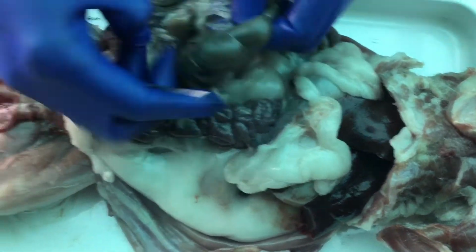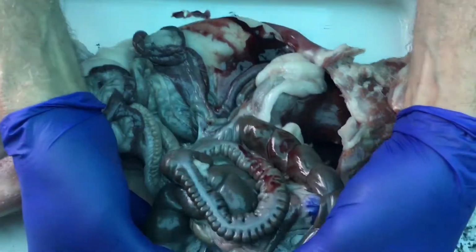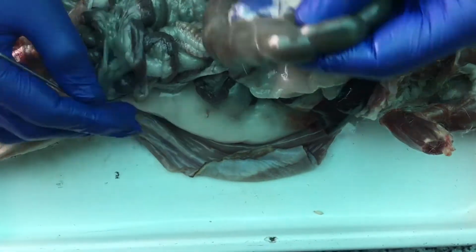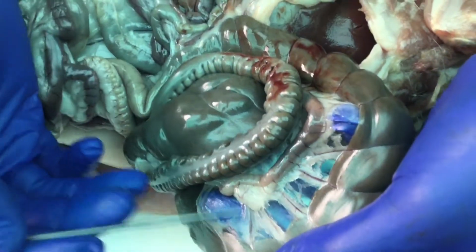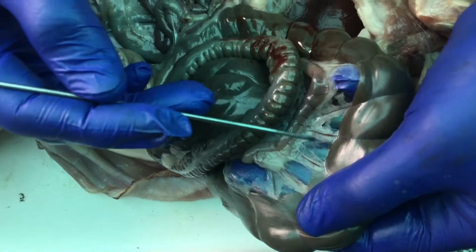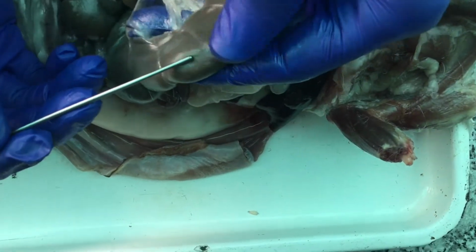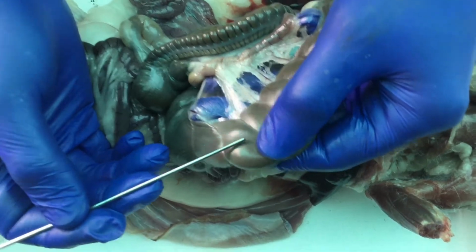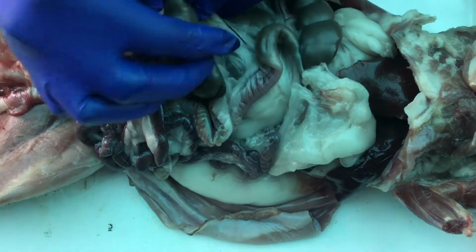I can also show you all this nice mesentery. All the intestines connect at the back body wall, and if we hold this up, you can see the blue of my glove between there, and that's just that beautiful connecting mesentery between the outer part of the body, all the blood vessels, see the blood vessels and nerves coming off of the aorta and the spinal cord coming out to the different parts of the intestines through that mesentery. That's how they get their nerve and blood supply. And then the intestines themselves are covered with what we would call visceral peritoneum. Again, that thin, sheeny, saran wrap-like layer that covers everything, absolutely everything in the abdominal cavity.